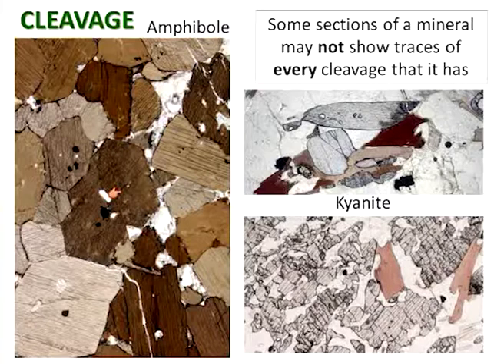In fact, another way of telling this with amphibole, and this is a particularly helpful amphibole crystal, is that it actually has an almost perfect basal section shape. It's actually 2 crystals jammed together, I think, or grown together. So this bottom one here shows an almost perfect hexagon. It's a bit wobbly and blurred over here, but then you can trace the hexagon back up there and across there and down there. So really nice. But don't always expect basal sections to look quite so nice.